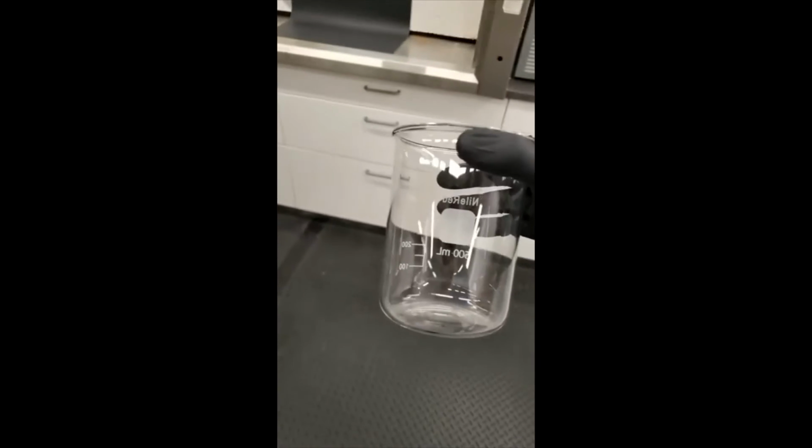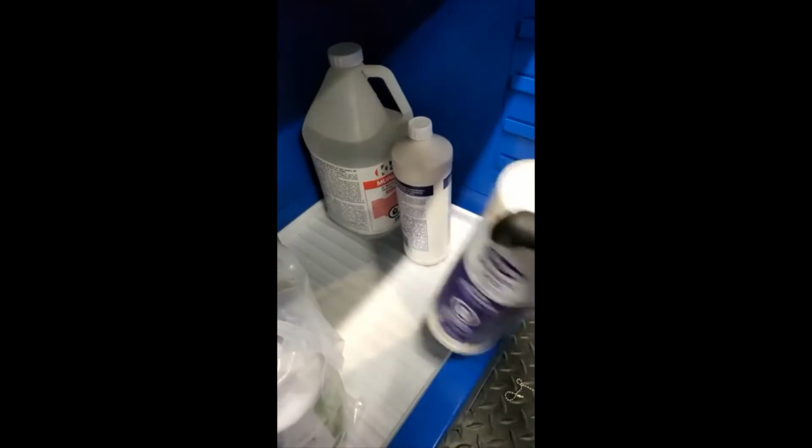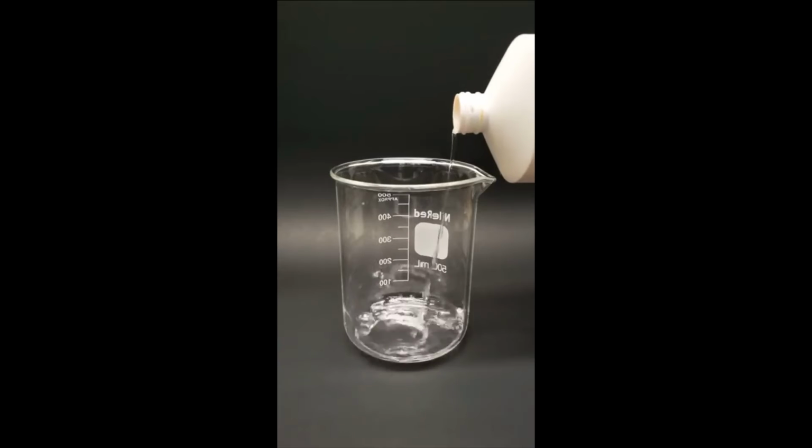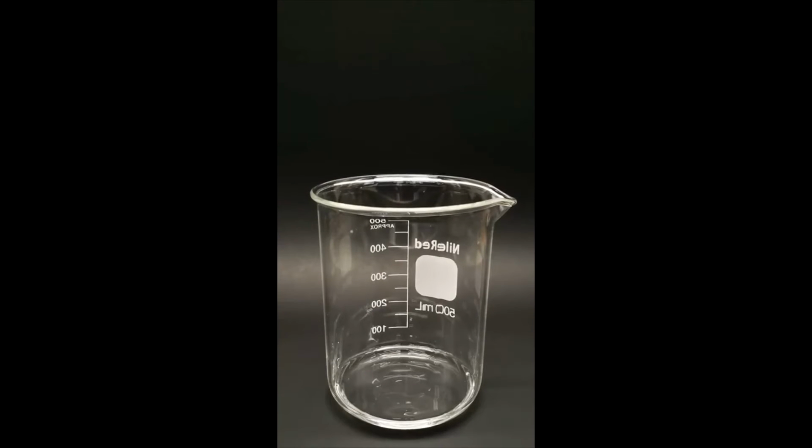It's pretty common for things to react as liquids and solids, but they can also react as gases. To show this, I just have to do something that I always find fun. Into a beaker, I'll pour some hydrochloric acid, and then I'll slowly lower in another beaker with ammonia in it.